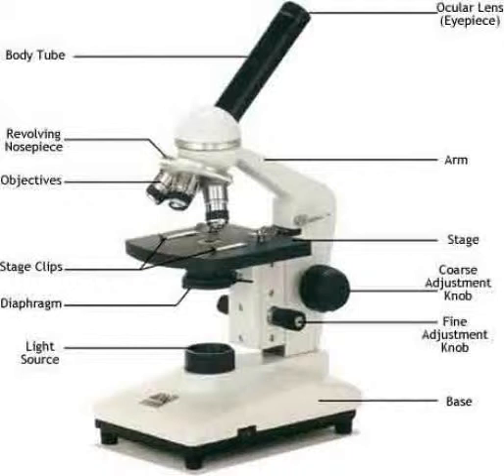Number 7. To learn how to see the depth of a specimen, obtain 3 pieces of colored thread about 1 centimeter long. Place the cross threads in a drop of water on a clean slide. Add a cover slip. Clip the slide in place on the stage. Focus up and down using low power. 8. Draw the cross threads showing the depth of focus under low power.